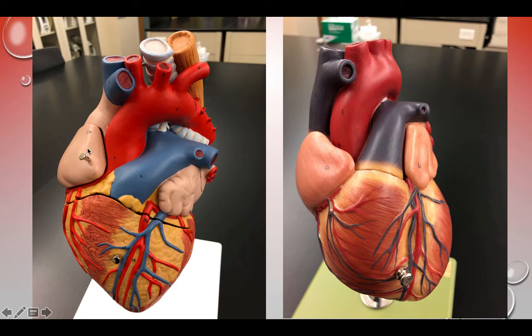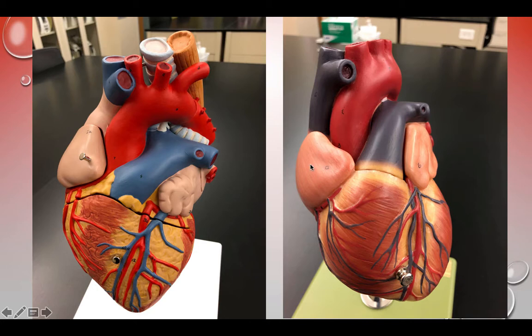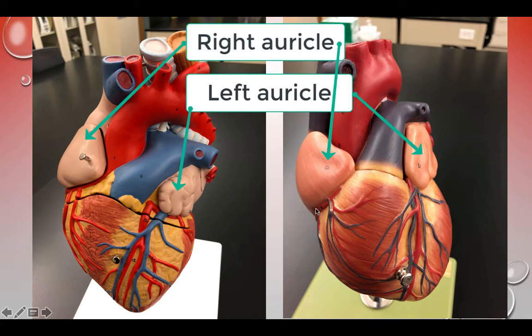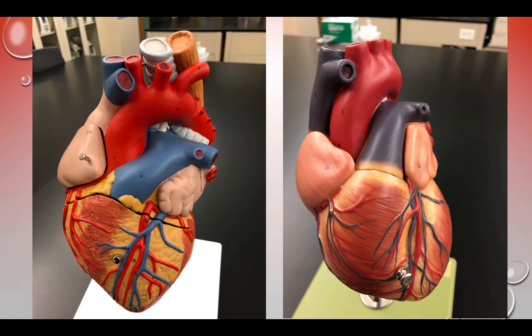I'll go through a couple of features on the outside — the exterior anatomy — and then I'll go through the internal anatomy. Looking at the heart here, these are the two auricles of the heart, and then down here are the ventricles. The auricles are part of the atria — you can call them atria or auricles. The atrium is the actual chamber and includes the auricle, which is this extra sac-like part that sticks out and allows for expansion of that chamber.